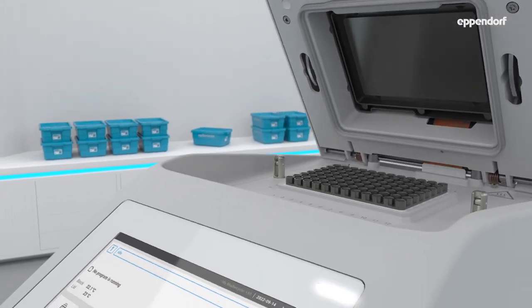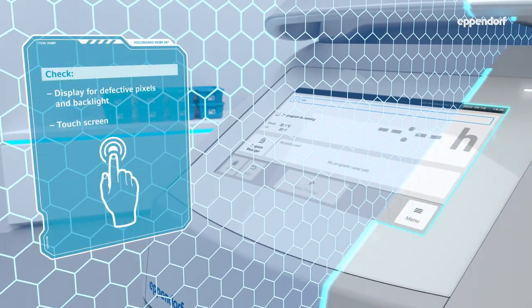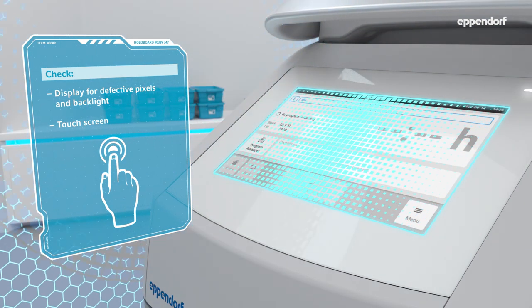Now that I've checked the cycler from the outside, I'll continue with the functional testing of the various software features.